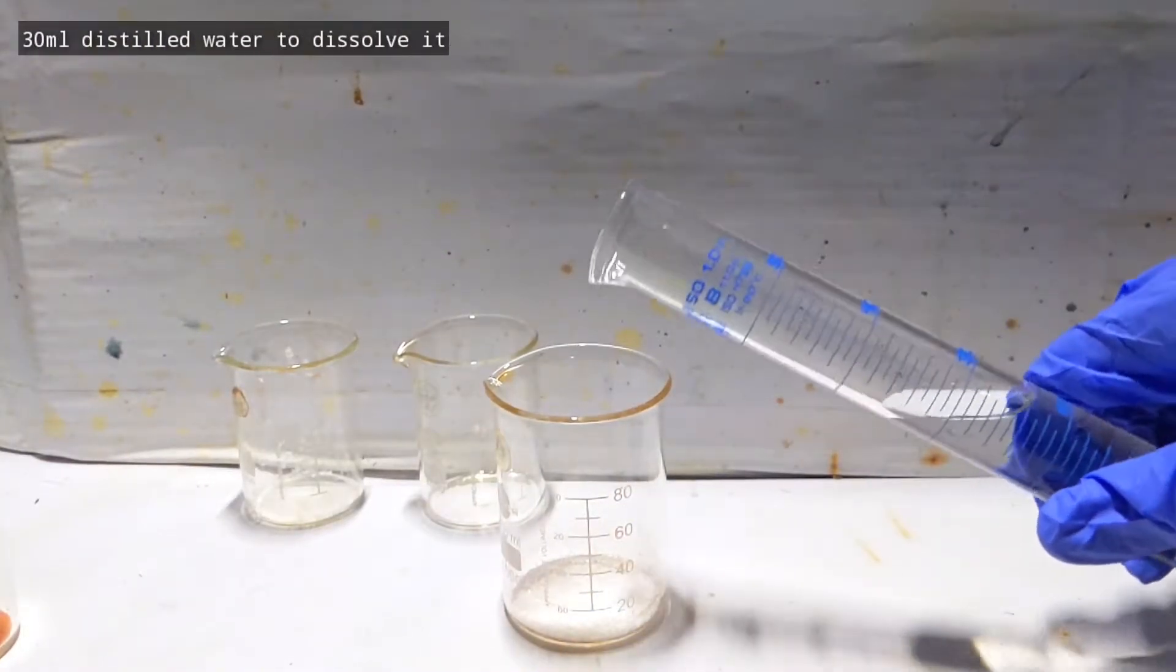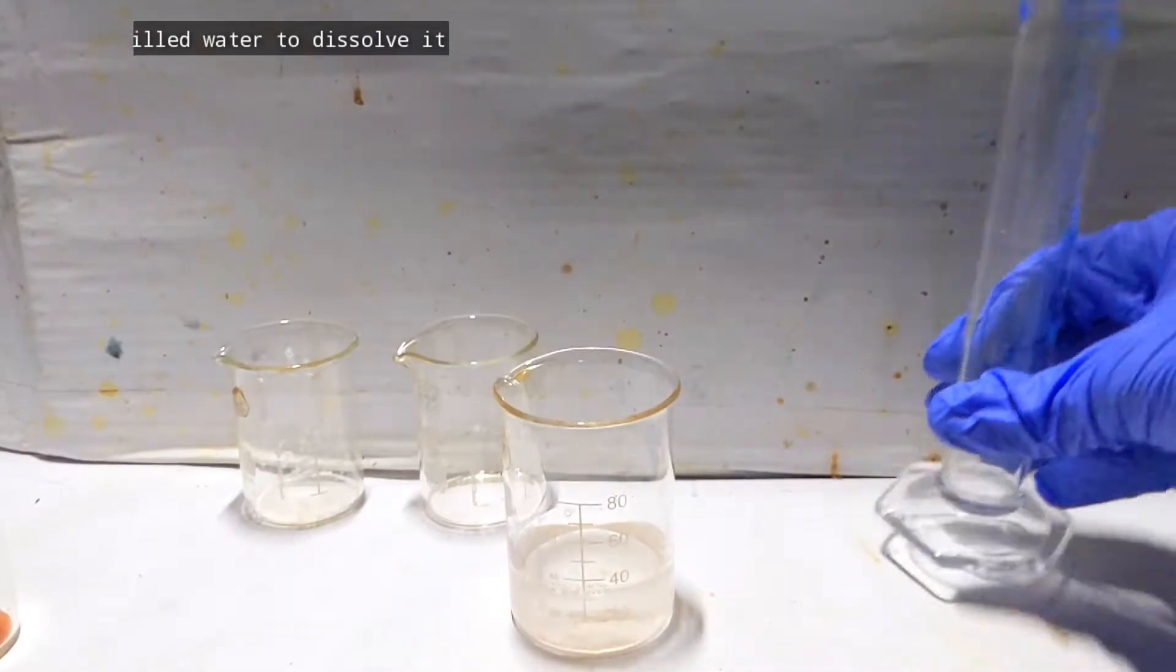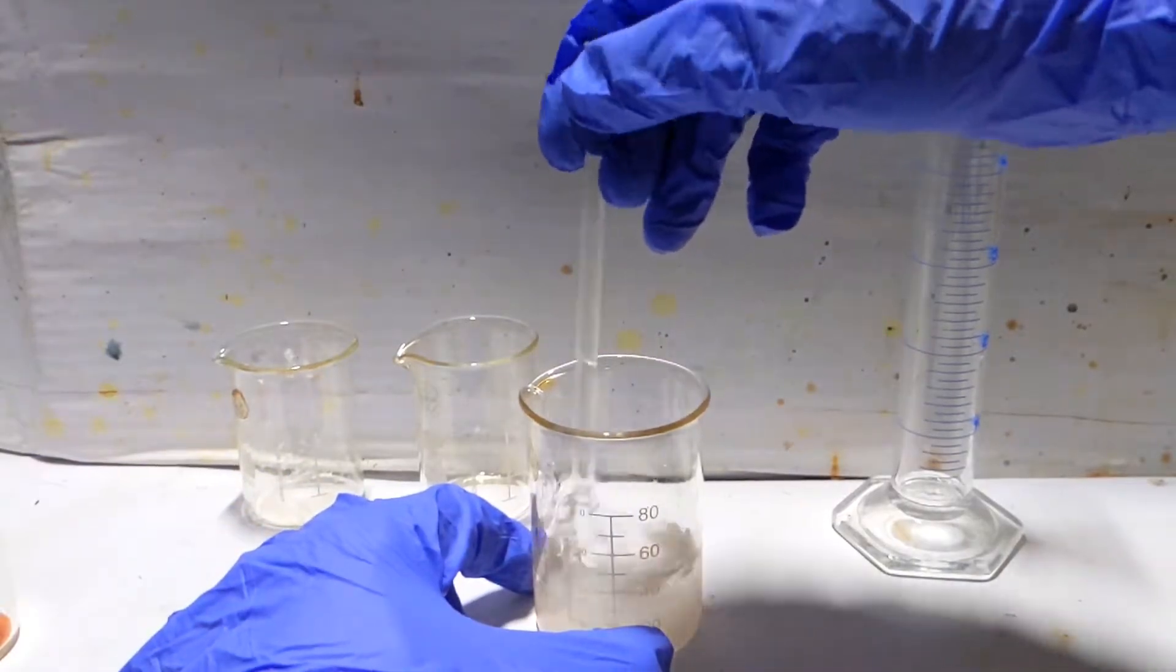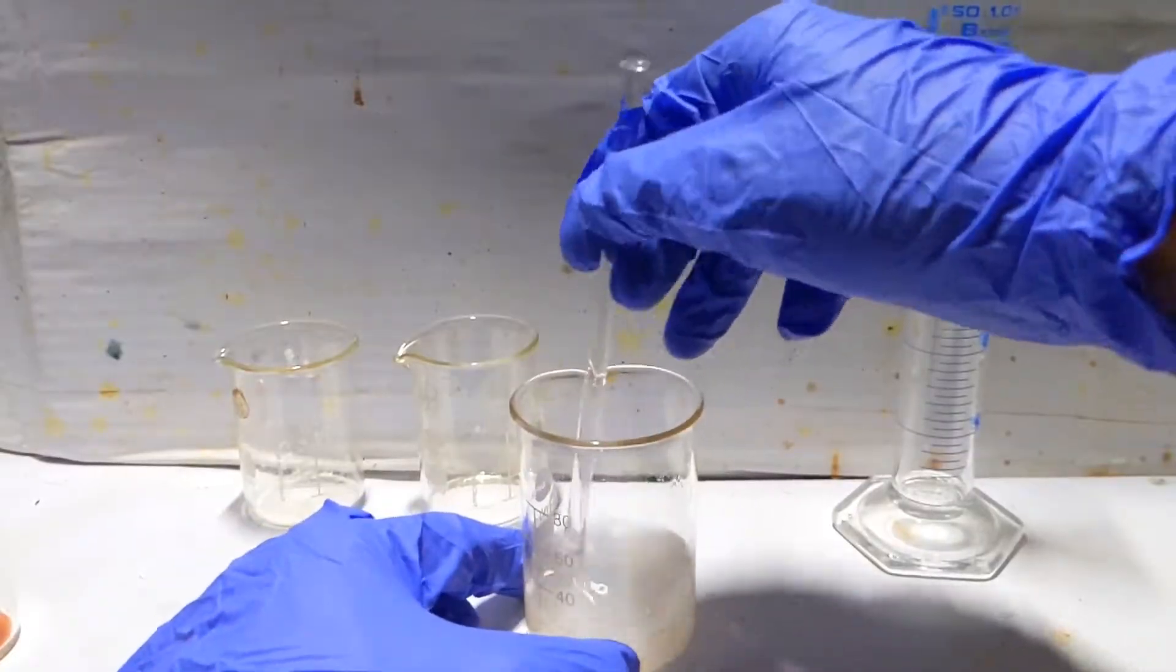30 milliliters of distilled water was then taken in a graduated cylinder and transferred to the beaker. A glass stirring rod was then used to mix up the contents. Both compounds dissolve in water, resulting in a colorless clear solution.